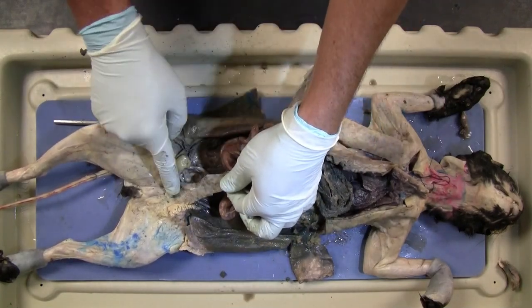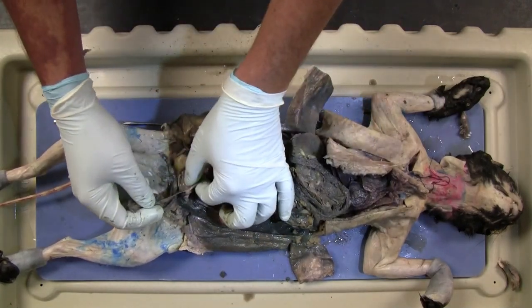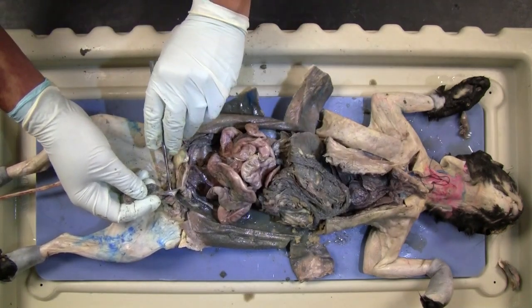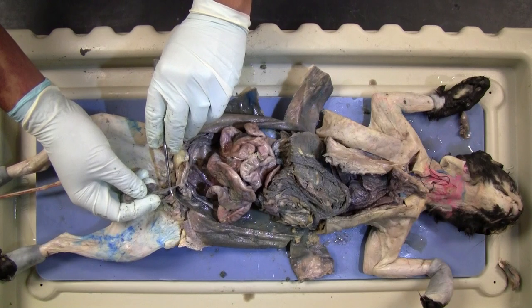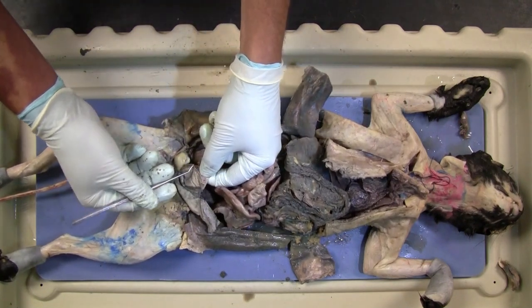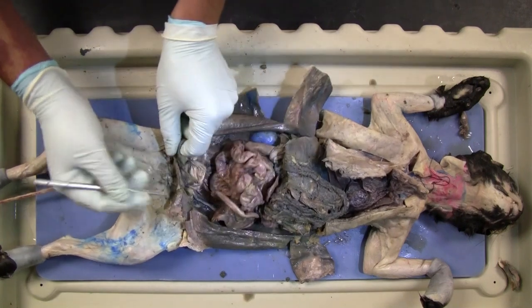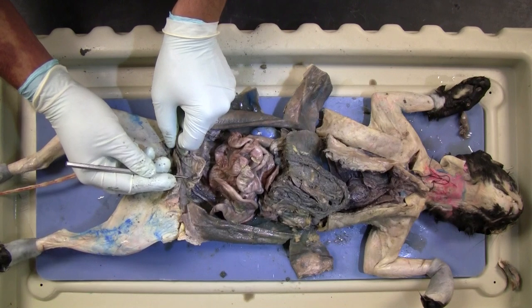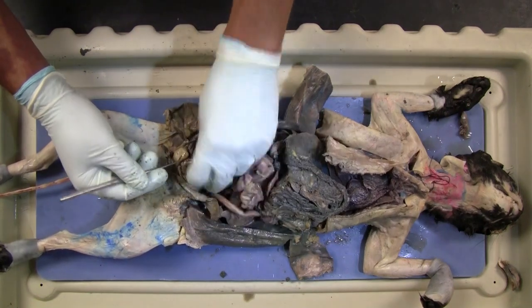Down here, this is the midline. So we look right here, we can see the median suspensory ligament of the bladder. And on the sides of both, lateral ligament of the bladder. And over here, lateral ligament of the bladder and fat pads.